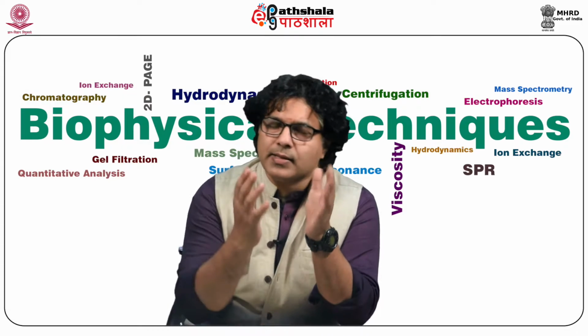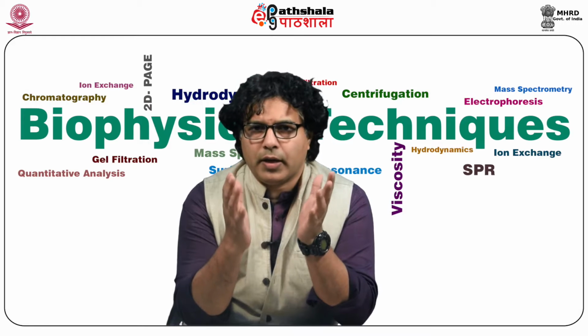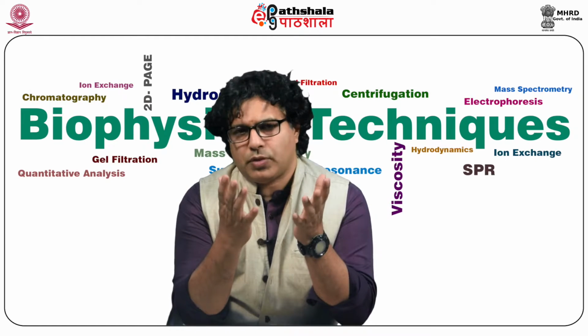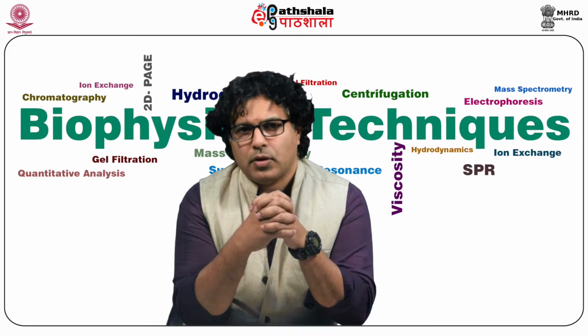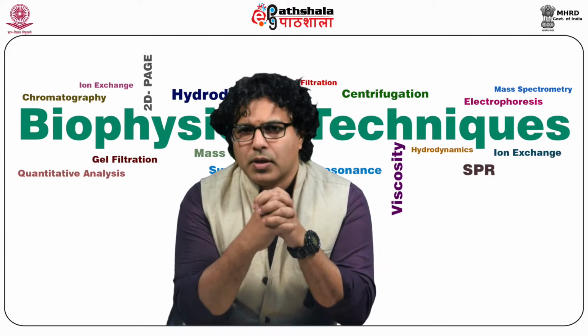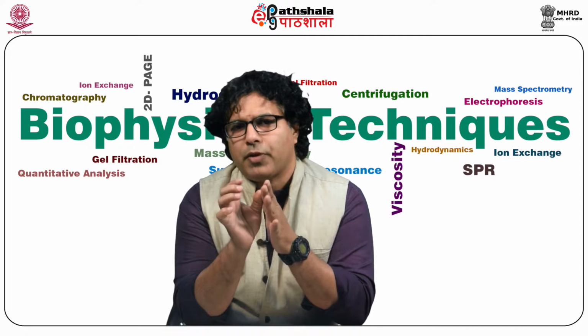Apart from classical multiple reaction monitoring or single ion monitoring in triple quadrupole instruments, several other modes of analysis can be carried out. For example, precursor ion scanning, in which we sometimes get a uniform fragment ion coming from a species.